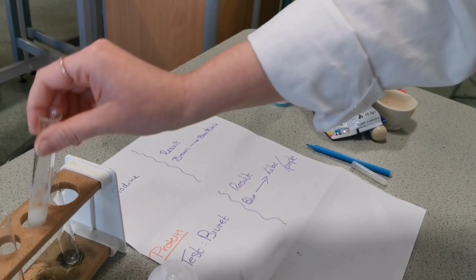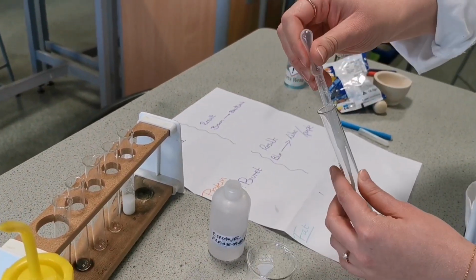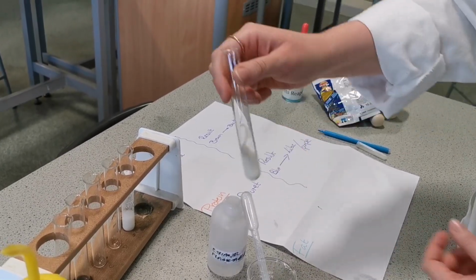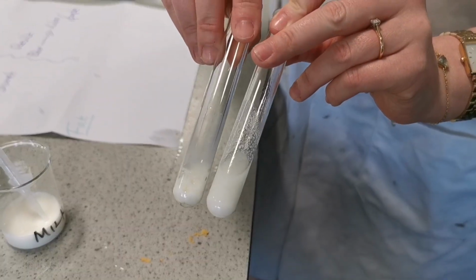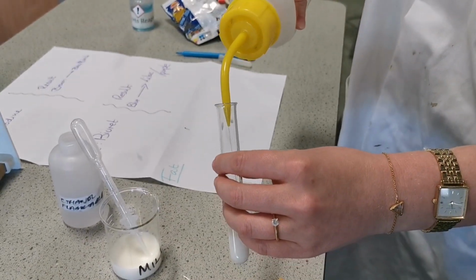But what if that had happened anyway? We're just going to do the test again, but not with ethanol. We're just going to put some water into the milk and see if there's a difference there. So we've got our milk again. If we just shake up the milk normally, you can see that we haven't got that same result. Let's add some water in just to see if it's what happens anyway when you thin the milk out. We'll pop some water in.